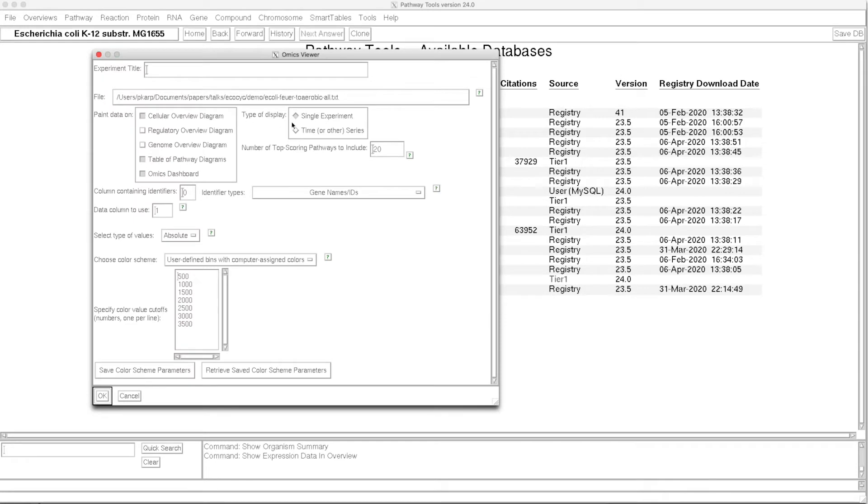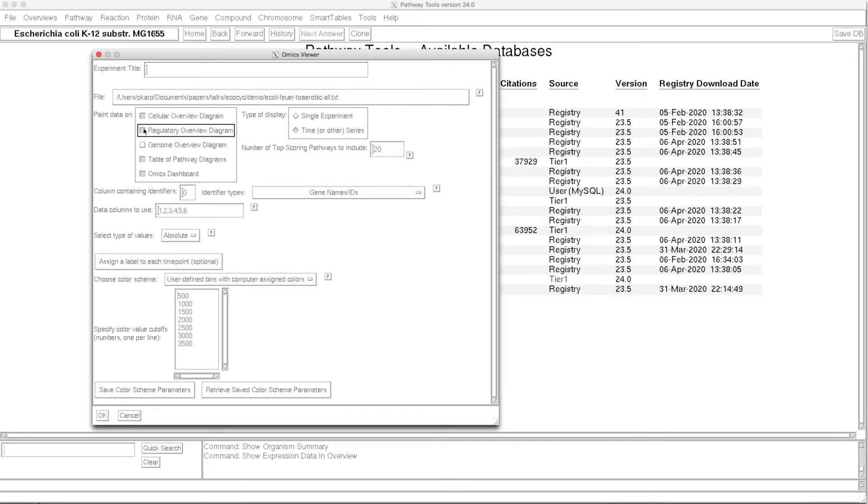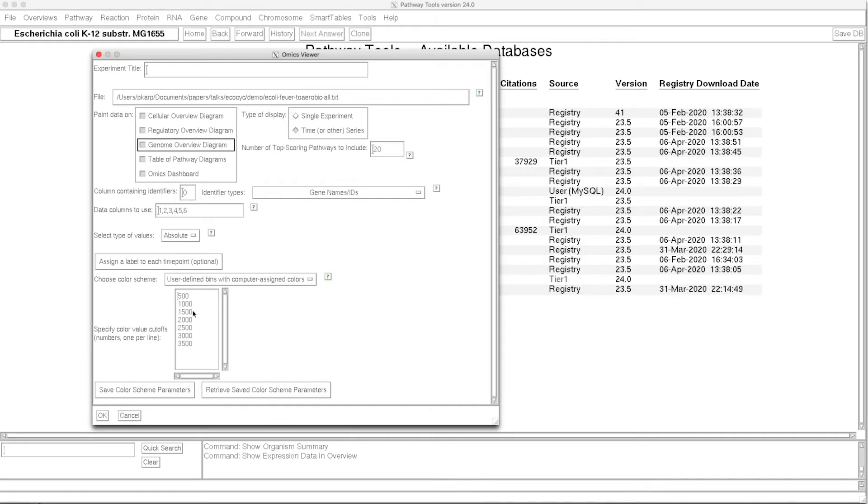We use this dialog to specify that we're going to use multiple columns from this data file. The first column is the identifier. Columns 1 through 6 contain the data. We're going to tell it to launch all five of our omics data analysis tools. We're going to use a user-defined color scale right here.